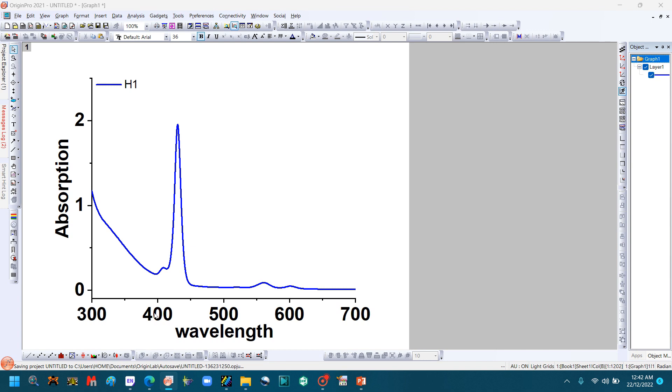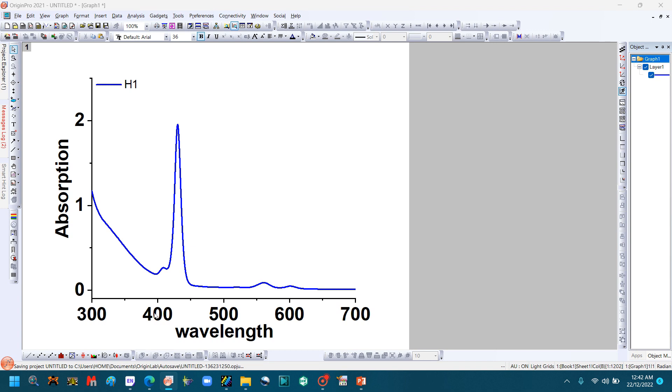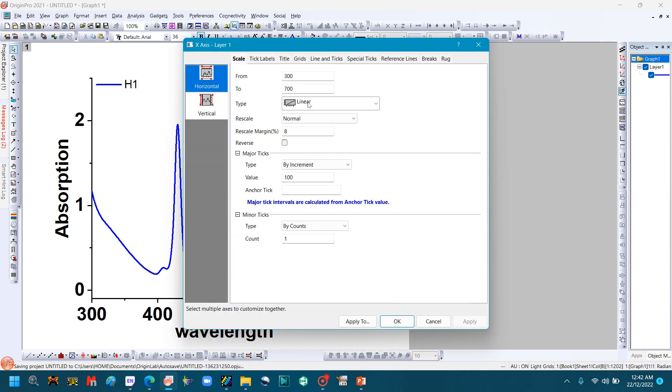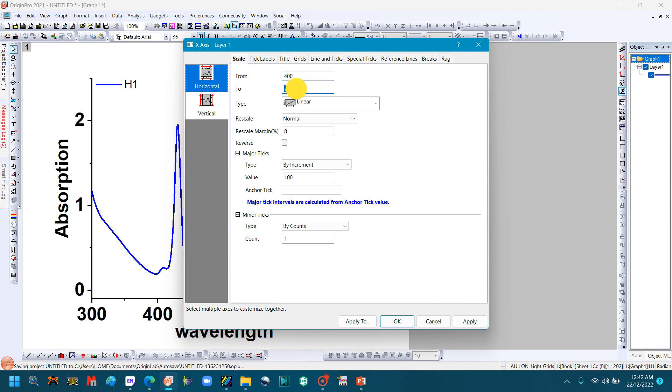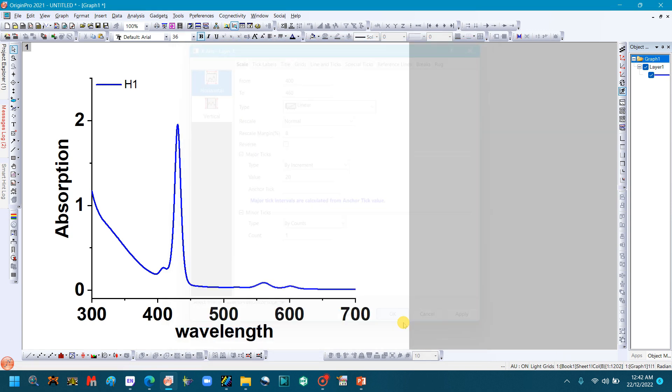And change its scale. Go to Scale and select the zoom area.